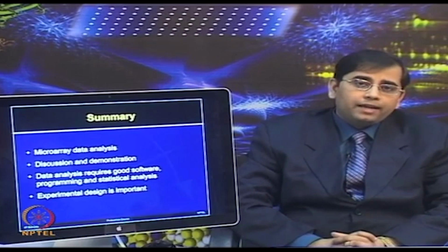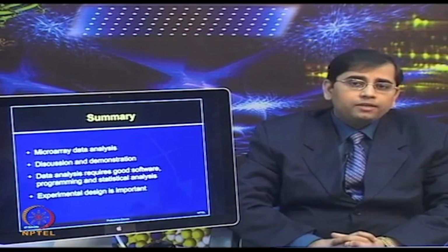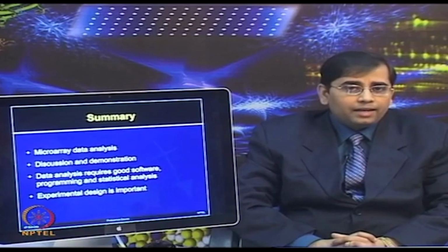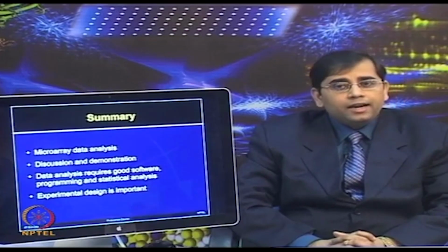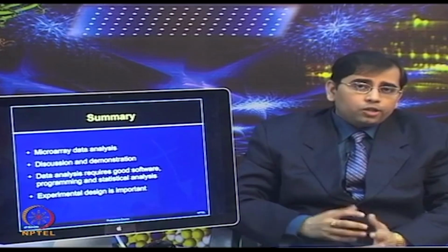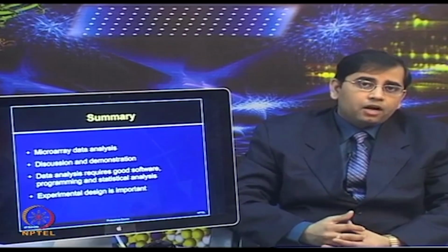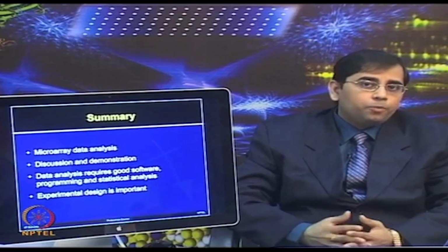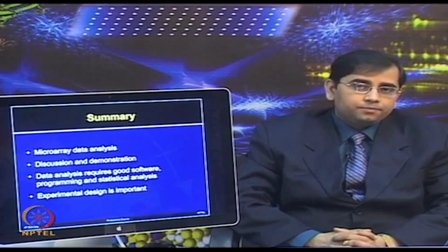The software tools can help in analysis, but it is more important to have a good understanding of both the biology involved as well as the analytical techniques, rather than totally relying on one software. You should also think about the biological context, look at the controls, and then after careful biological as well as analytical analysis, you can probably obtain some meaningful information from these data sets.